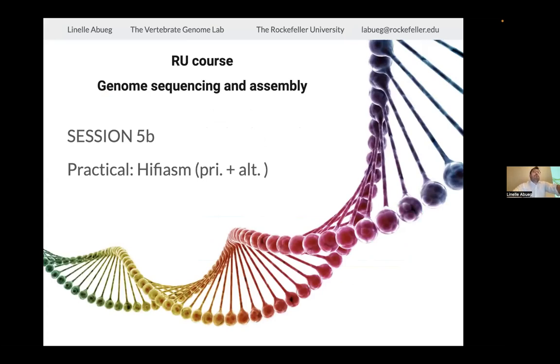Yeah. What's the state of the art you guys are using? If I were to give you a genome today, would you just do HiFi reads, or would you do a combination of HiFi with additional PacBio, or would you still use Illumina for polishing? We don't use Illumina for polishing, but it's always good to have to estimate the quality of your genome, right? This Illumina data is important. So you can estimate the real QV of your assembly if you have data that hasn't been used in your genome, right? But otherwise, just HiFi and Hi-C, you get a beautiful genome.